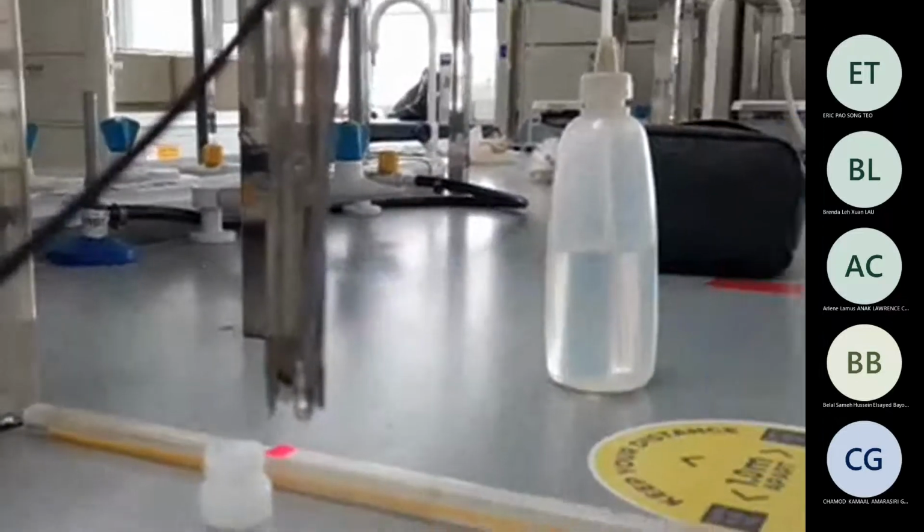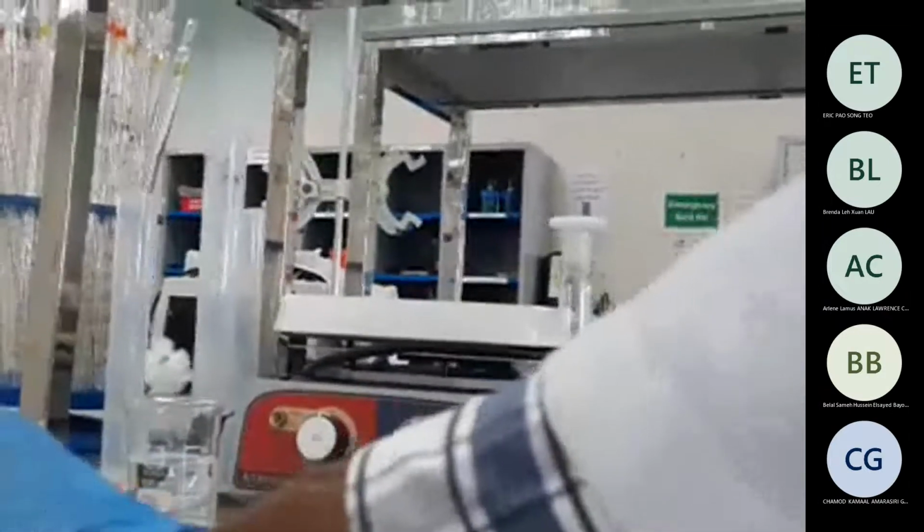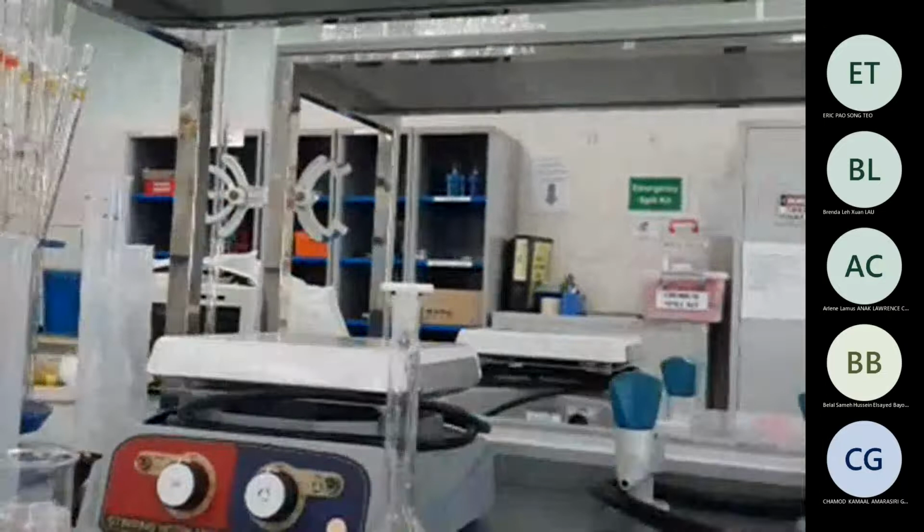Okay, so now it is ready for my second thing, and that is CH3COOH. You have to take another beaker and rinse it. This is not HCl, yeah? Rinse it a little bit.